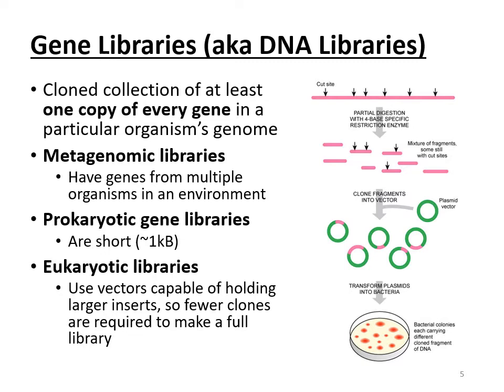As you see in this figure, we can take an organism, let's say a bacteria's entire genome, so every gene it has, and we chop it up, and each piece ends up in a plasmid. Then we do transformation, and you get a single plate that has all of the genes of that bacteria's genome represented in that single plate.